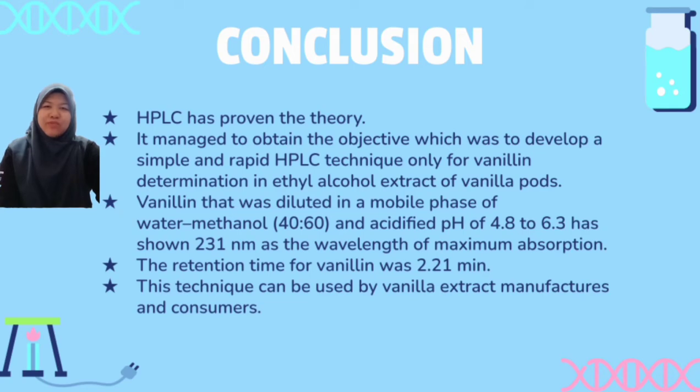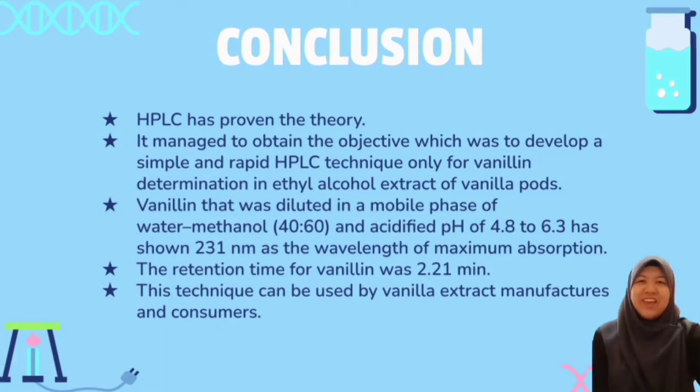Hi, my name is Nofazihani binti Hassan, and now it's my turn to present the conclusion. As a conclusion, the method used to determine vanillin in vanilla essential oil, which is HPLC, managed to provide a good result. It also achieved the objective, which was to develop a simple and rapid HPLC technique only for vanillin determination in ethyl alcohol extract of vanilla pods.